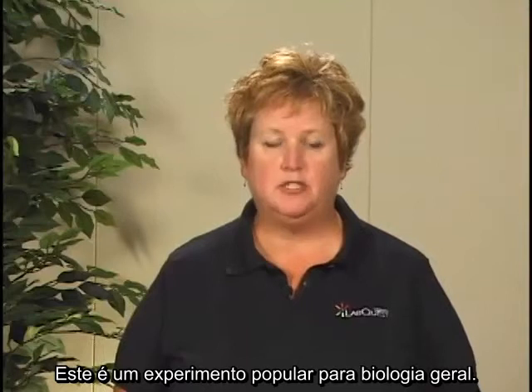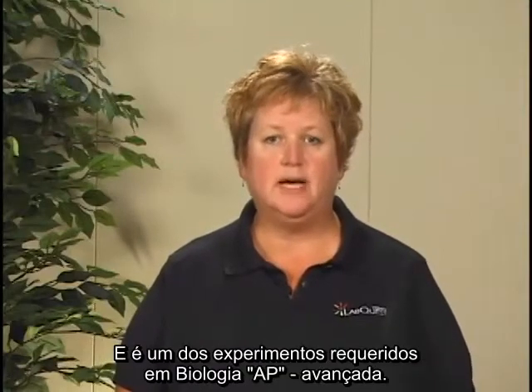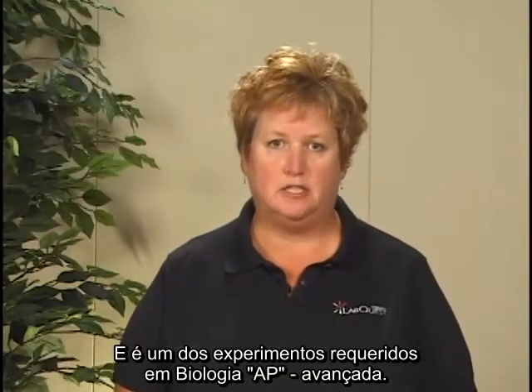This is the cell respiration experiment that can be found in both the Biology with Vernier and the Advanced Biology with Vernier lab manuals. It's a popular experiment for general biology and one of the required experiments for AP biology.